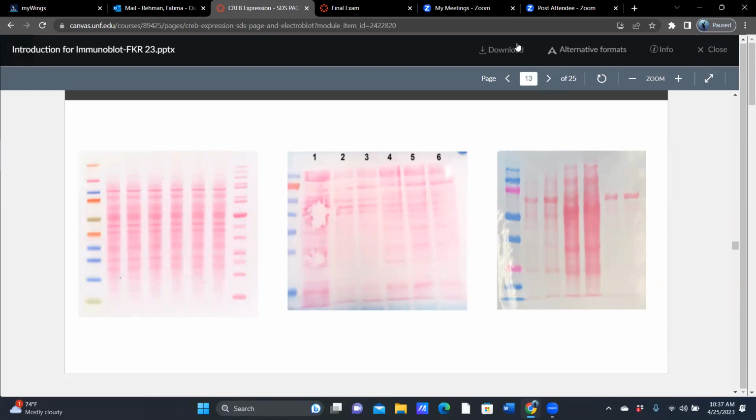Now, if there are bubbles in just this lane, can I use this? I want to compare these 6 samples, and I want to compare my favorite protein's level of expression in these 6 samples. They are probably different, like untreated and low, medium, high, and a combination with something else. Who knows? But I want to compare the level of my favorite protein in these 6 samples and make some conclusions. Can I make conclusions about my favorite protein using this blot?